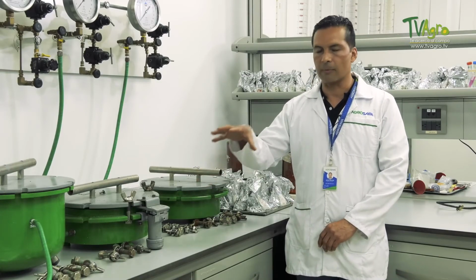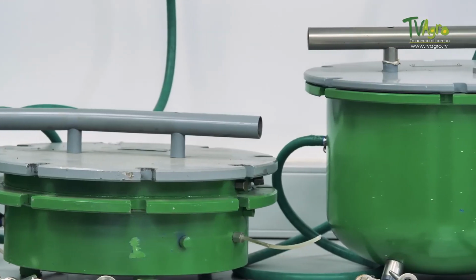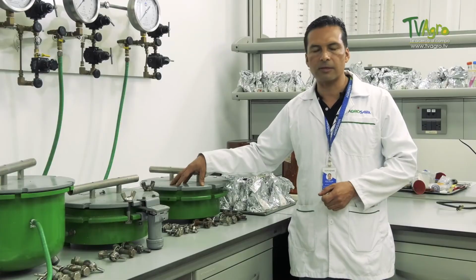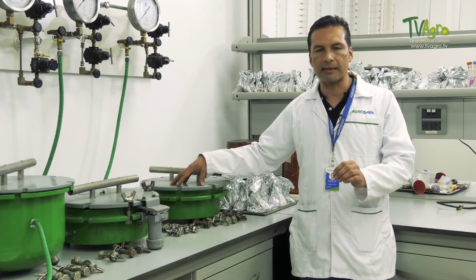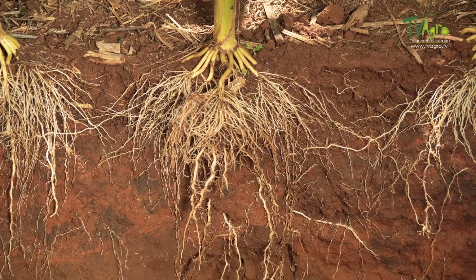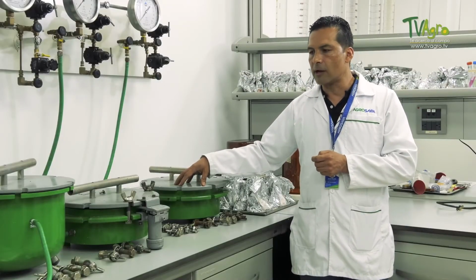So this test consists of taking a soil sample brought from the field in rings where the sample is taken as such. It is placed inside these pressure pots and certain pressures are applied. The idea is, as I said, to try to simulate the process that the plant root has in the soil, because the plant has to make a certain suction of water, and it can only suck the water that is available in the soil. Then these equipments allow us to make this simulation.